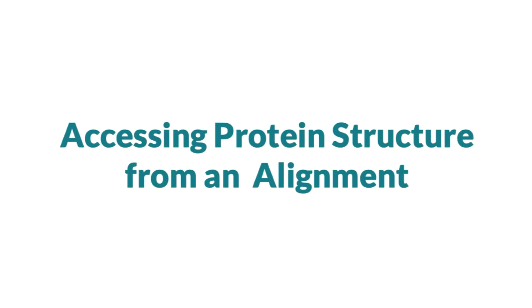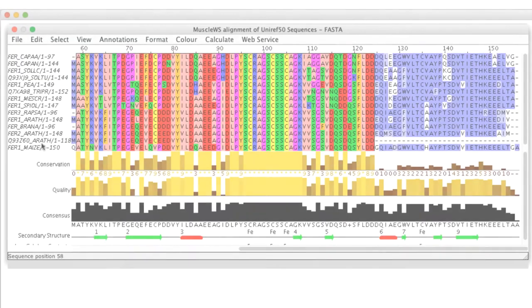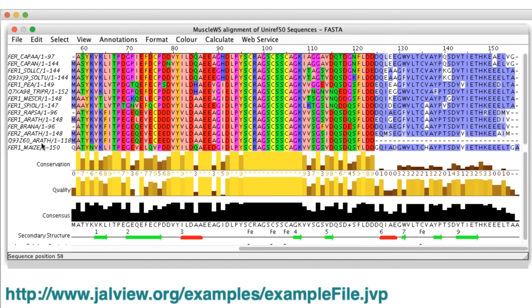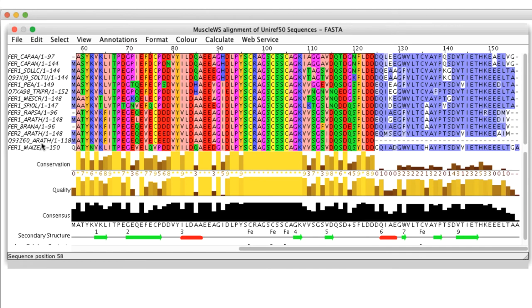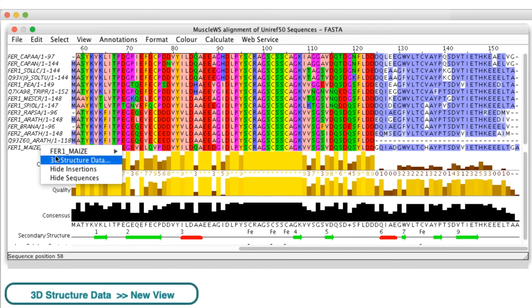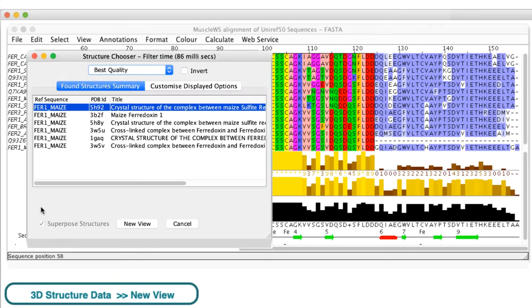If an alignment is already loaded in Jalview, for this demonstration I have loaded the ferredoxin alignment using the URL on the screen. To view a structure, in the alignment select the sequence of interest, right-click the mouse to open the context menu and select 3D Structure Data. In this case, there are a number of structures available.